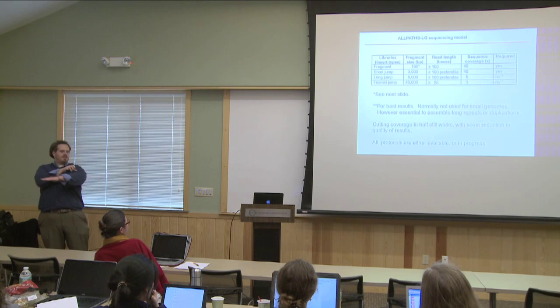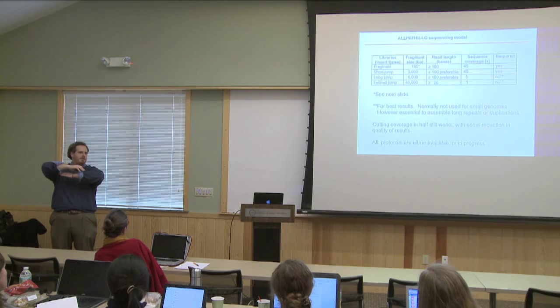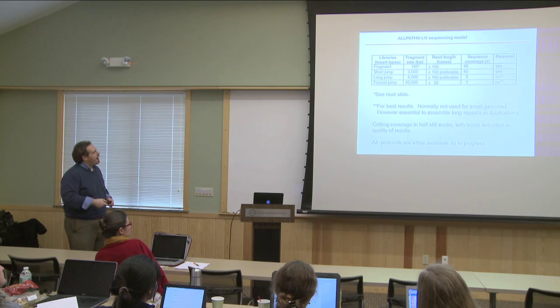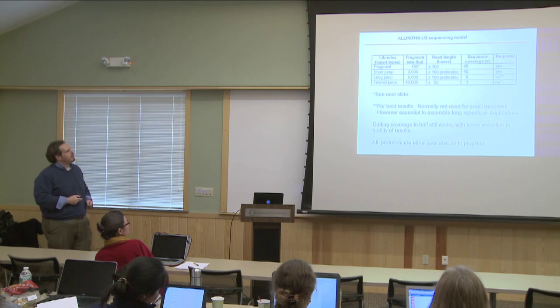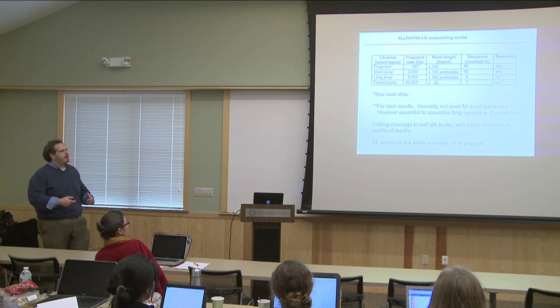Instead of being restricted to using k-mers that are at most 100 base pairs long, now we have reads that are 180 base pairs long. We can use much longer k-mers, get across much longer repeats. So that's a really good thing to do in my mind. It was very clever of them to recognize that we could generate those data.